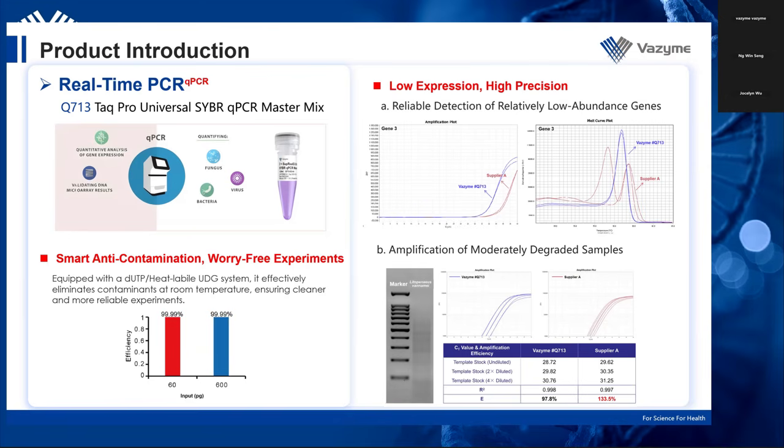your current protocol, and then what happens is you get more than one amplification curve for what you are targeting. That's contamination. This dUTP system prevents this from happening. But there's a caveat, which is that you need to make sure that the machine only uses master mixes with this system. You cannot mix and match. You cannot use a different PCR mix that does not have this exact system. Otherwise, it defeats the purpose because of the way it works.